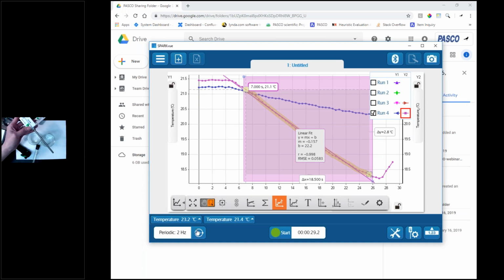While I'm waiting for questions to come up, I want to point out that on the temperature sensor, the sensitive part is just that last centimeter down here. So you don't have to have the whole stainless probe in whatever you're testing. It's just that last centimeter. So that might give you some ideas of the freedom that you have with using this wireless sensor. It's really not that much, so you can save liquid that way. Okay, I don't see any questions for the temperature sensor, or if they come up, I'll address them when they do.